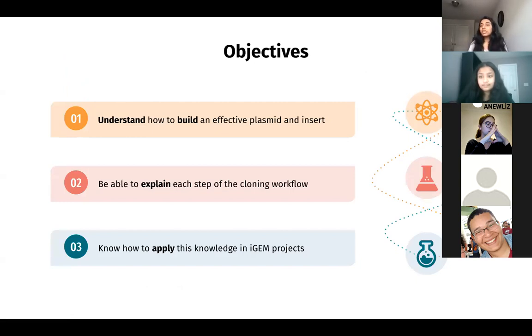Let's talk about some of the objectives of this session today. So one, we want to understand how to build an effective plasmid and insert. Two, we want to be able to explain each step of the cloning workflow. And three, we want to know how to apply this knowledge in iGEM projects. So I'm sure you all are aware that iGEM is a synthetic biology competition. So the skills that we teach you today will give you a great head start in creating your own project.